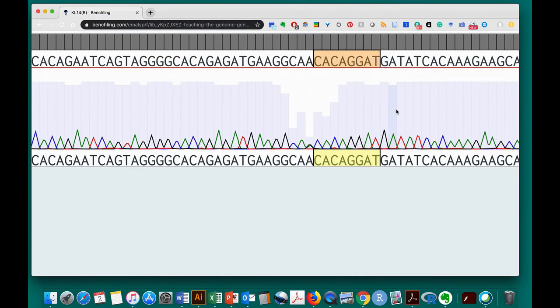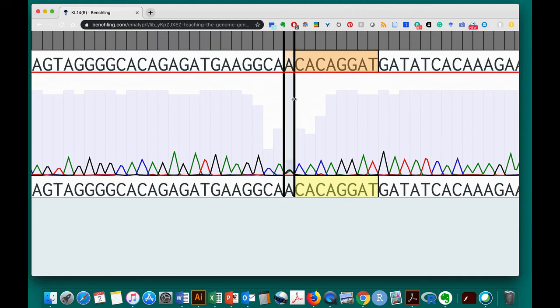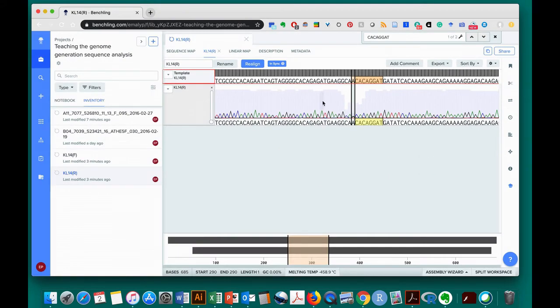And instead of looking at the next downstream base, we want to look at the upstream base because we're in the reverse complement. And here we can see an overlapping AG, the reverse complement of which would be TC. So that is our SNP call, TC for SNP2.